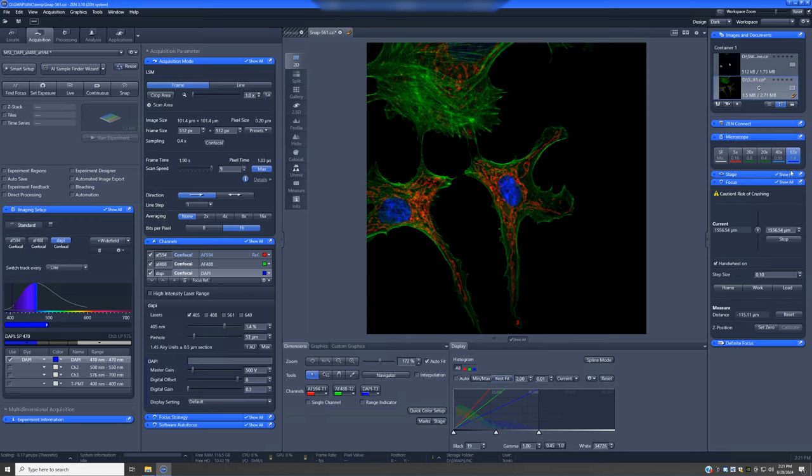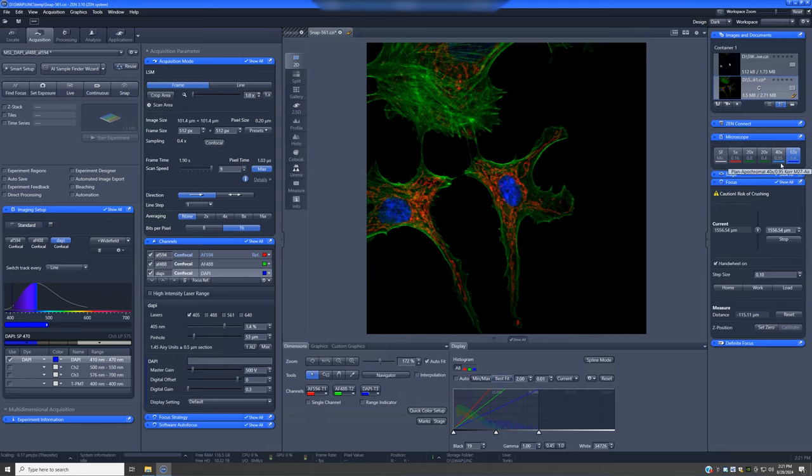If you have scenarios where the resolution provided by the 20x0.8 is not quite good enough, but you really don't need oil and you want to scan a large region where using oil might complicate things, we have this intermediate objective, which is a 40x0.95. This is an air objective.